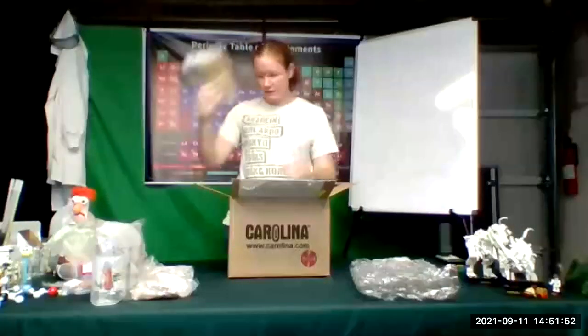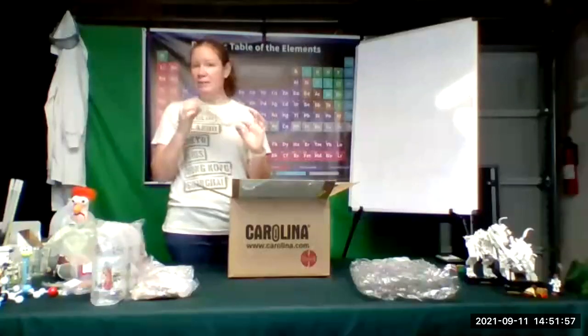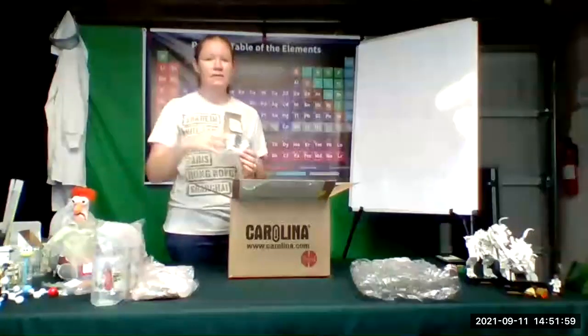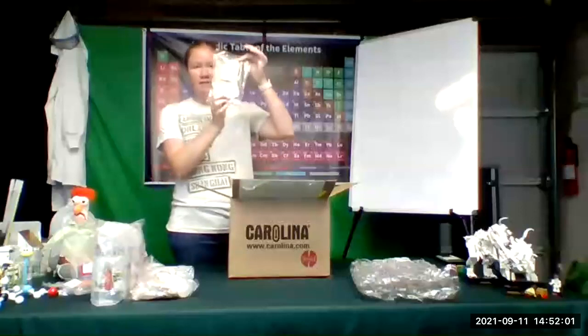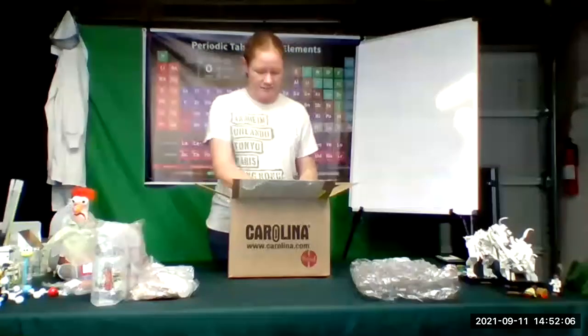Exploring physical and chemical changes, which is the one we're doing next week. So this might be supplemented by some of the stuff in the bulk sets, but you will definitely need this little package for our work next week. So I'm going to set that aside.